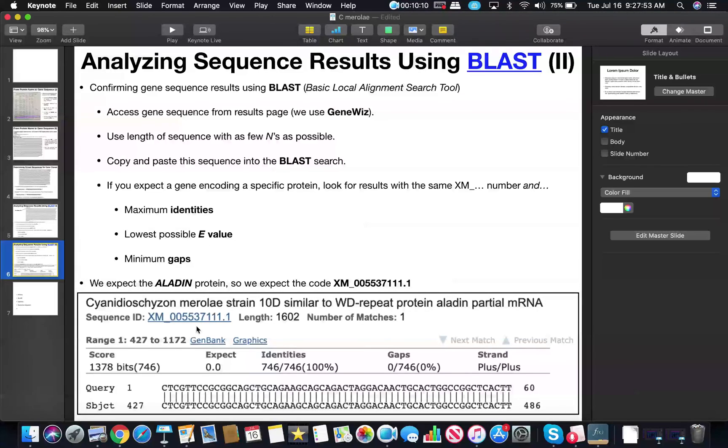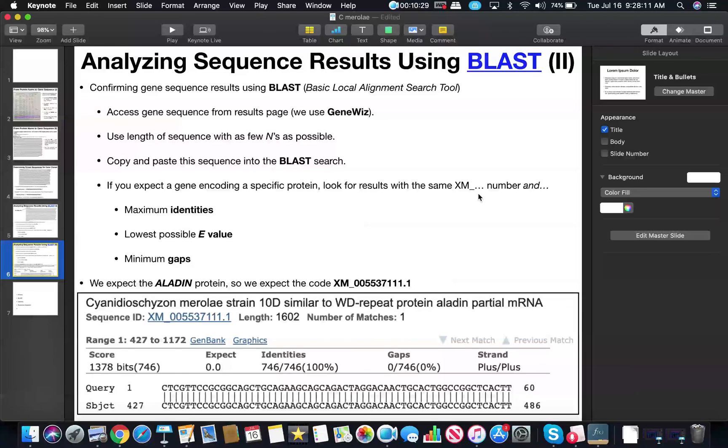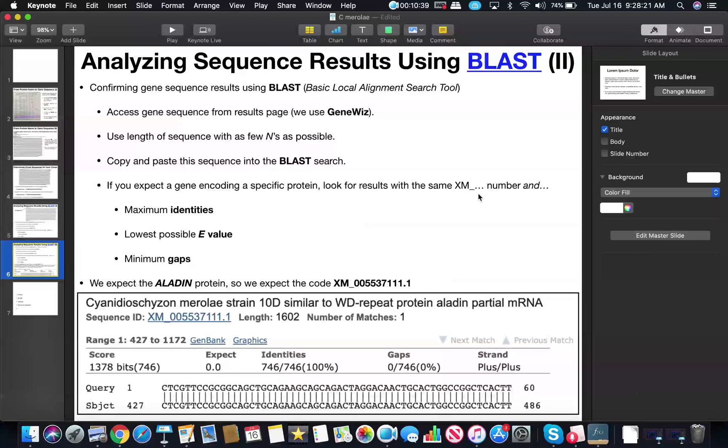And so the key is you want to make sure that XM number matches up, but maximize the identities, the lowest possible E value, and have minimum gaps. And this is again basically the result that we got. Assuming that your XM number is a match, then you have positively confirmed that your gene sequence is the same as the gene of interest. And that's the utility in BLAST. So hopefully that makes sense.